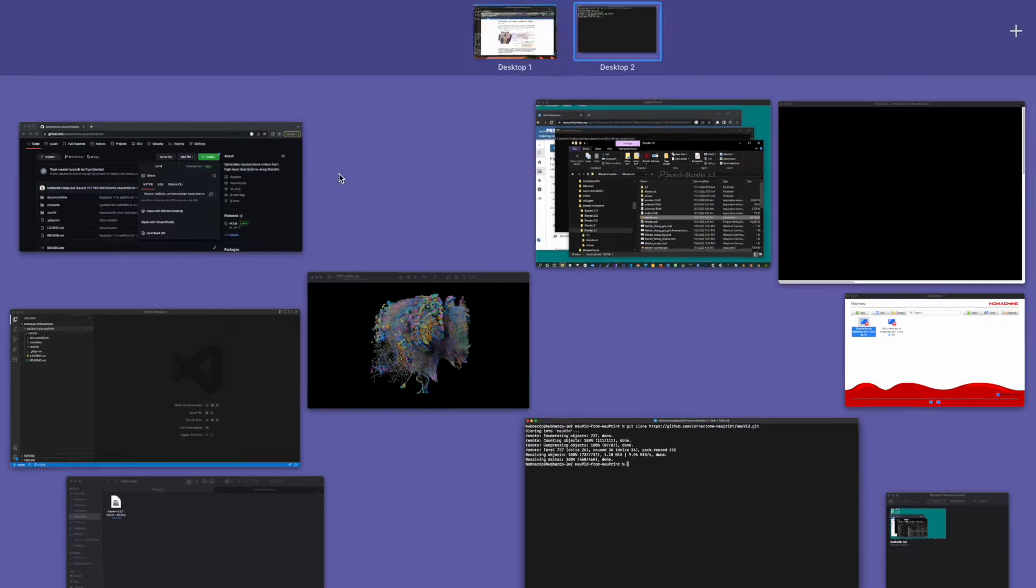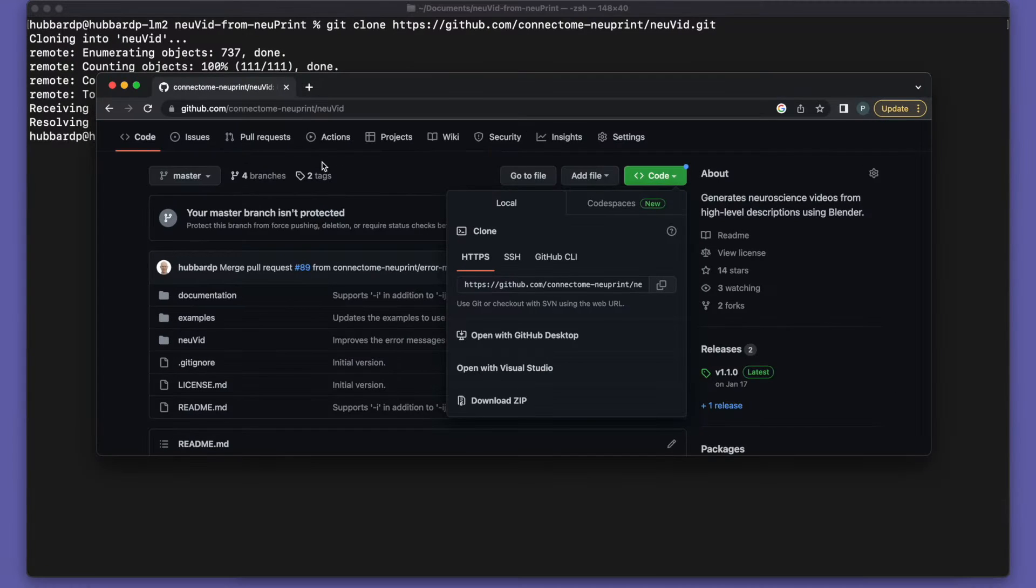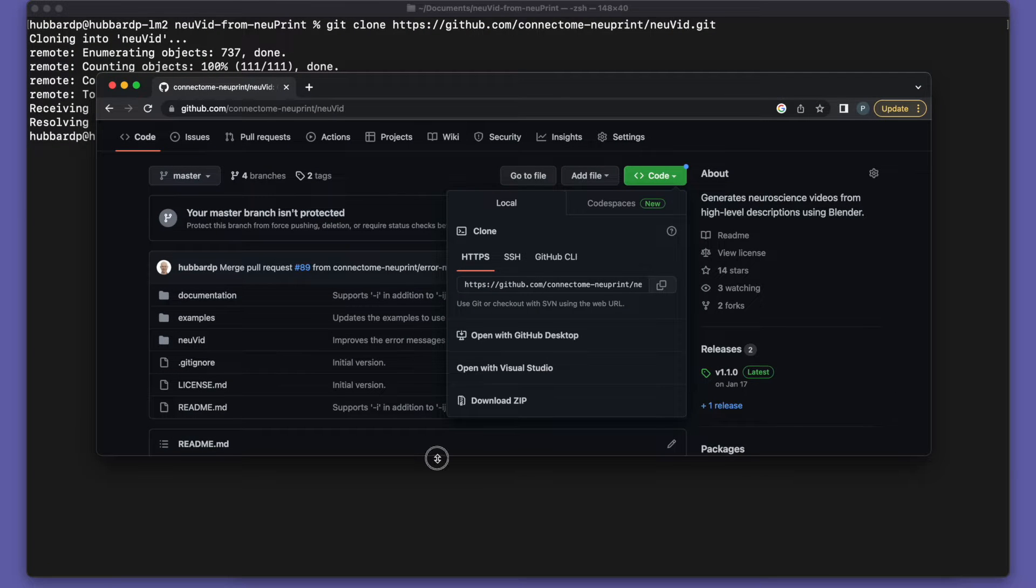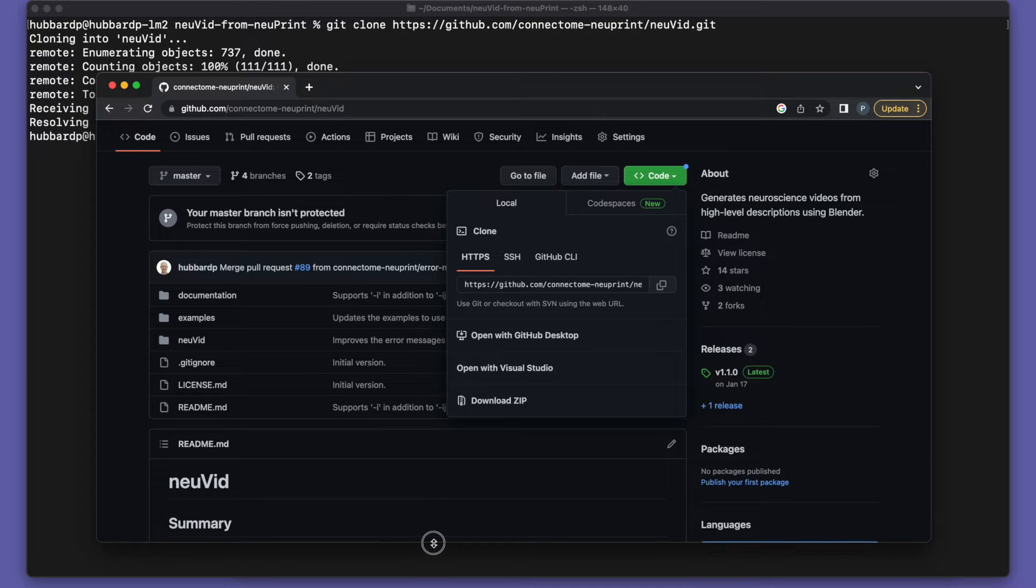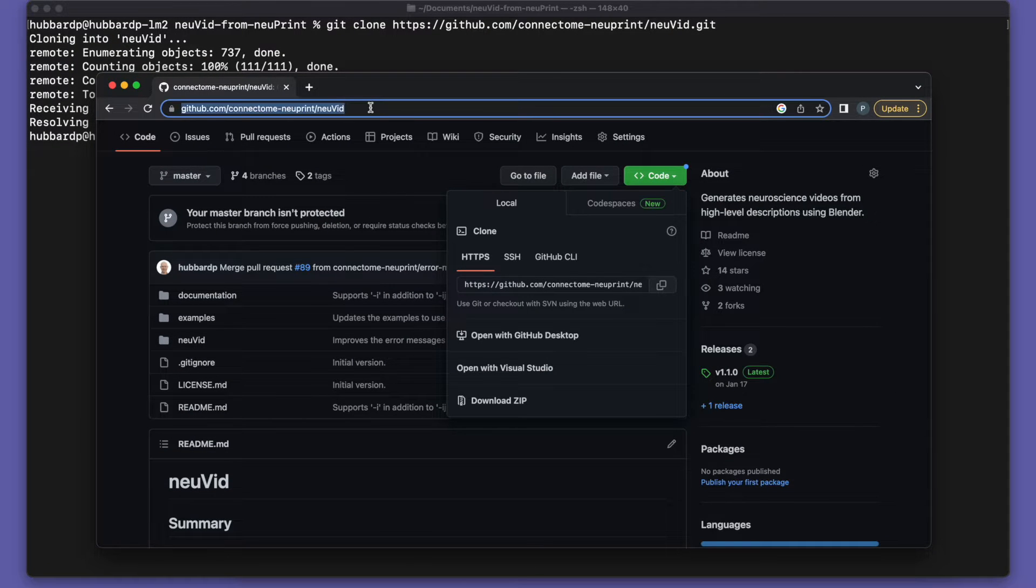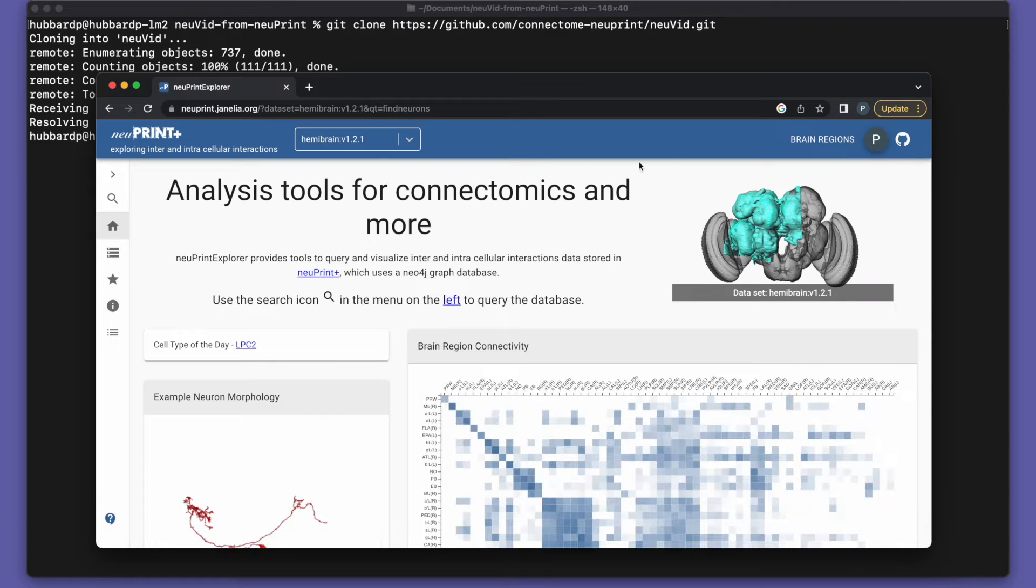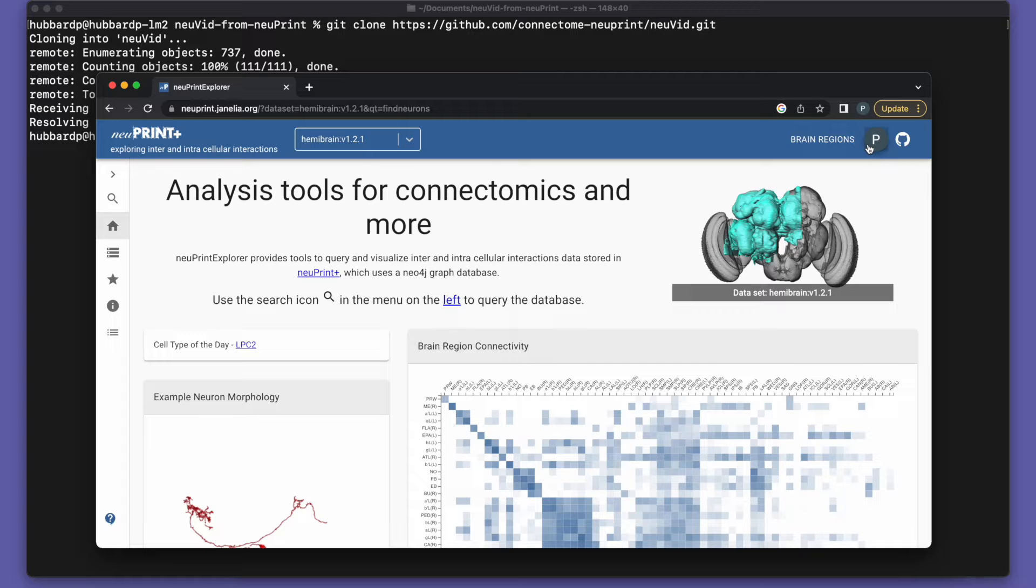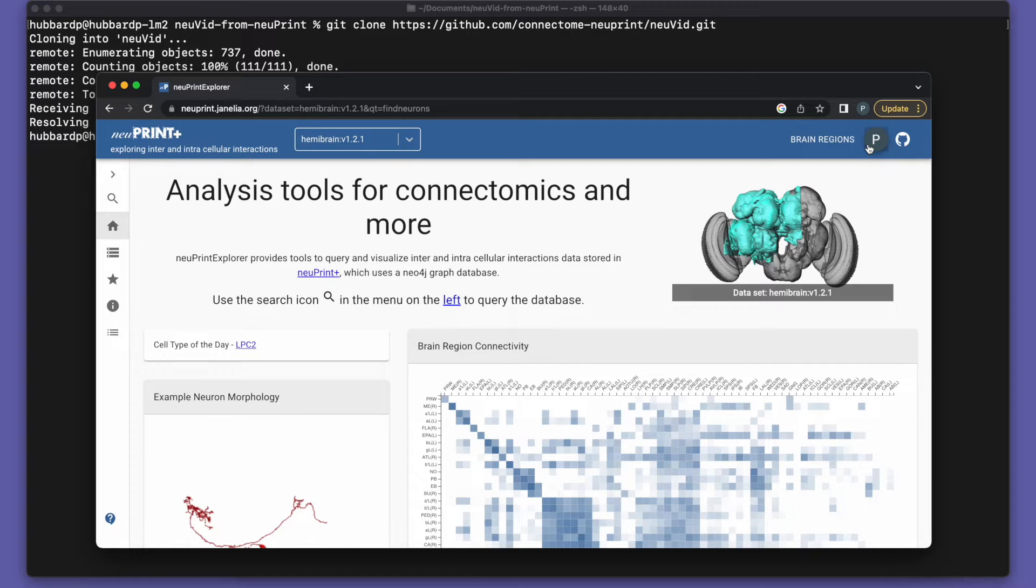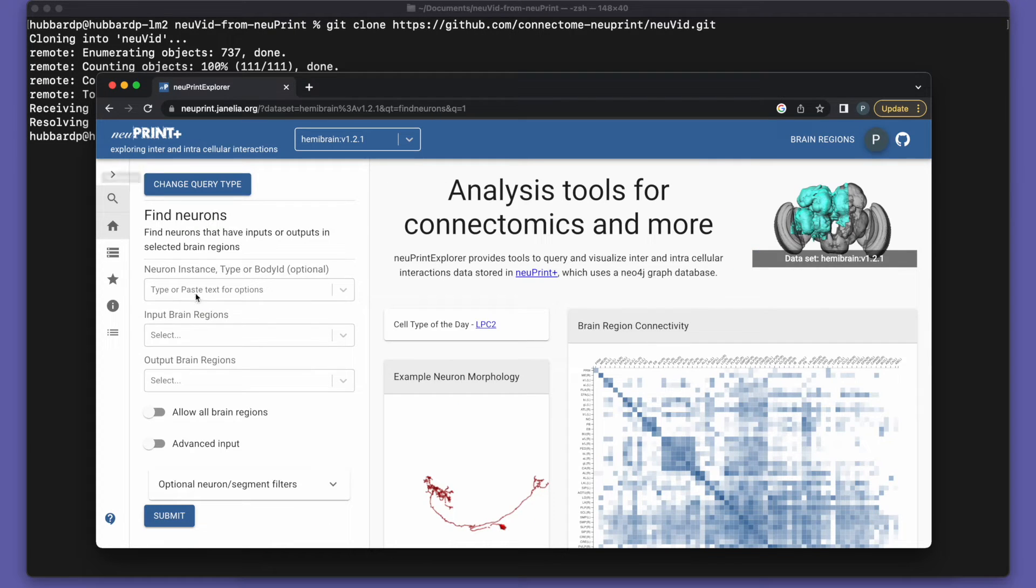Now we're ready to make some content. So we'll go to the Newprint site, newprint.janelia.org. I'm already logged in over here. The first time you use Newprint, you log in with your Google credentials, as in your Gmail address, and then you can start searching for neurons.